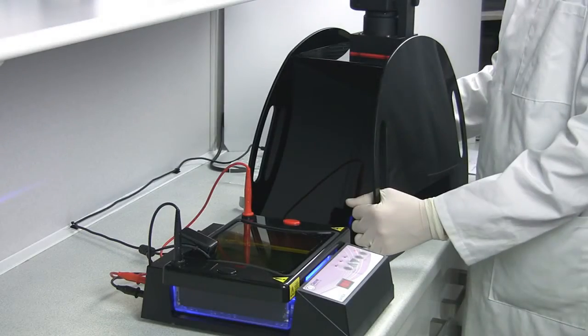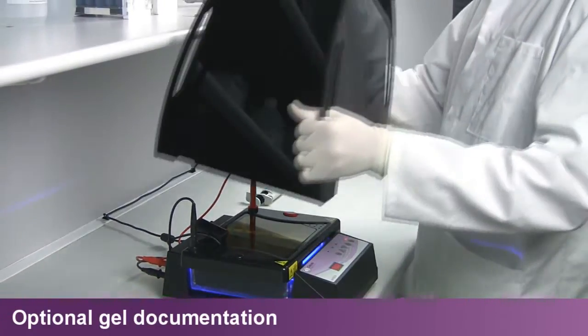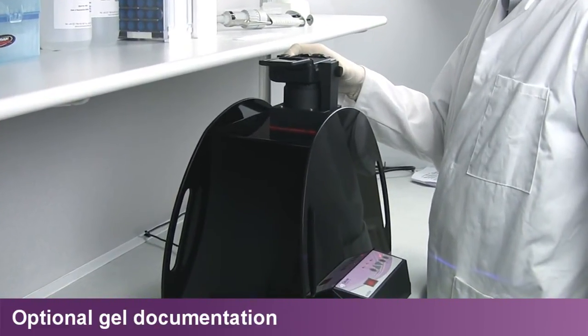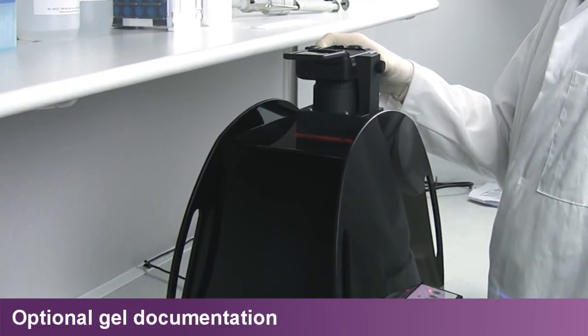The RunDoc gel documentation system, equipped with a 10-megapixel camera and emission filter slide, fits quickly and easily around the base unit and gel tank for in situ gel documentation.